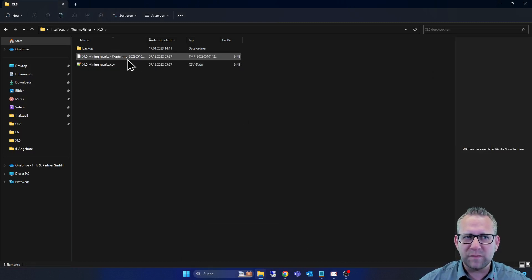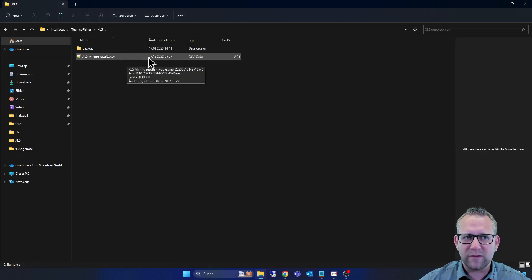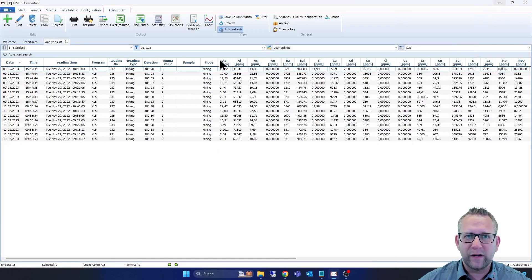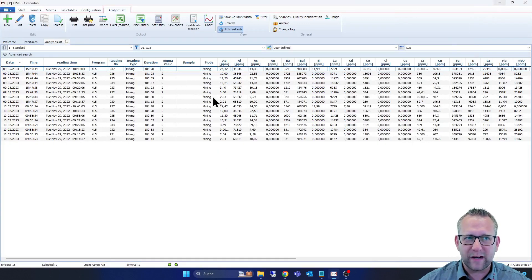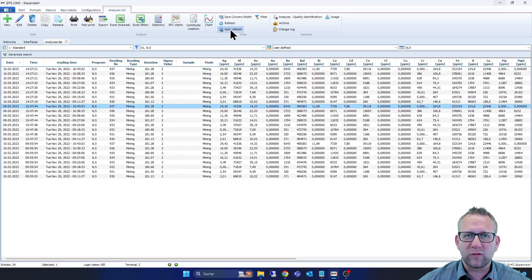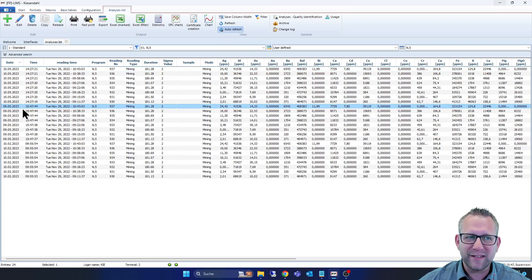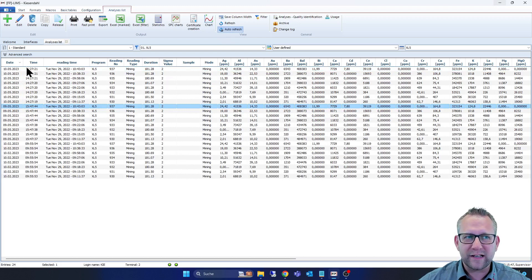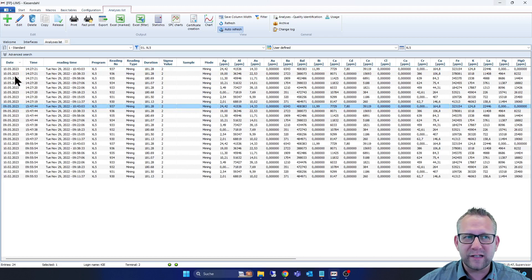And we see here the files from the XL5. Now I go to the folder, copy this one. You see automatically our software picks this file. We go here into the analyzers list back, and we have enabled the function auto-refresh. And now you see the analyzer goes automatically to the top of the analyzed list, and you see all analyzers that we read in from this file.